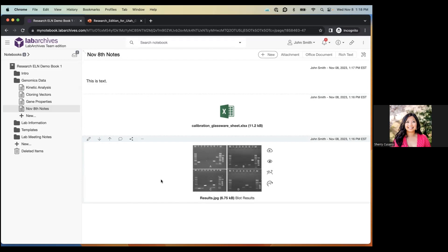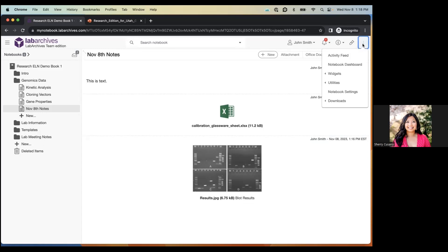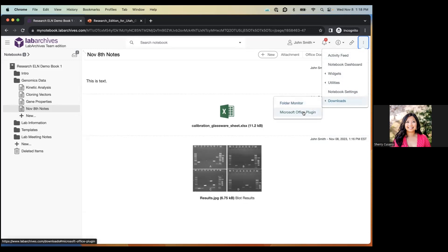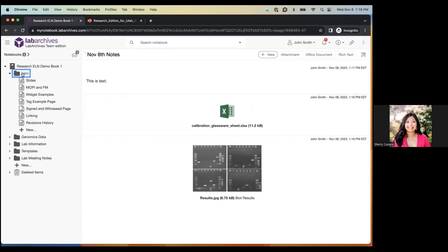There are other ways to send files to Lab Archives even without the browser open, using software-specific integrations. Our most popular integration is with Microsoft Office. We have a Microsoft Office plugin and a Folder Monitor tool available for download. To access them, click the triple-dot menu, hover over 'Downloads,' and you'll see Folder Monitor or Microsoft Office Plugin. Clicking either brings you to the download page for Mac or Windows.